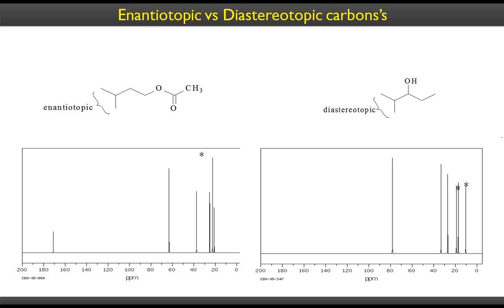But you have to be careful when you have situations like chiral centers and rings, so you had better draw out the structures in a 3-dimensional form and then assign the number of peaks. Otherwise you could be doomed, and there could be some traps, right? For example, this compound has 2 methyl groups on this carbon, but you can have free rotation. That rotation would make these 2 methyls equal to one another. This methyl is the same as this methyl chemically and magnetically. There is no reagent that can differentiate this methyl from this methyl. There is no reaction. So they are chemically equivalent.